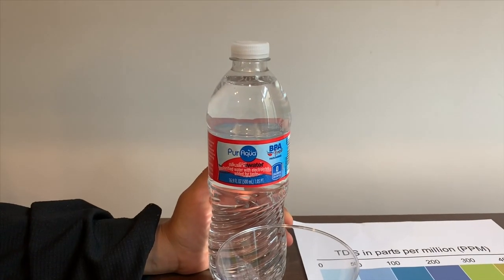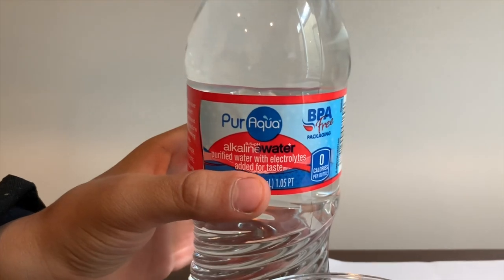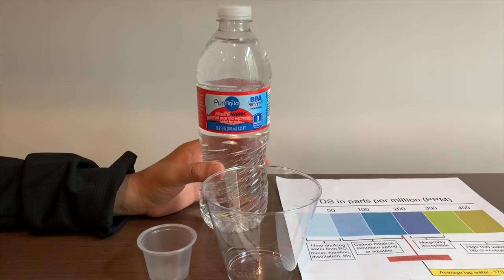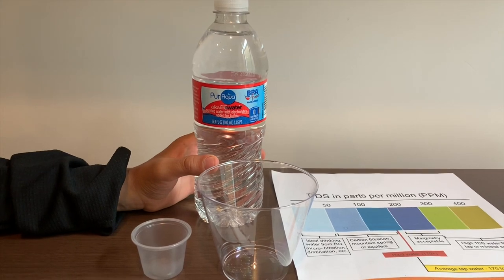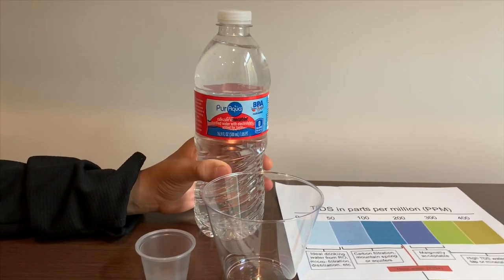This is Pure Aqua alkaline water to purify water with electrolytes added for taste. We bought this at Aldi in a pack of 24 and it cost $3.29. Let's test the pH and TDS levels.